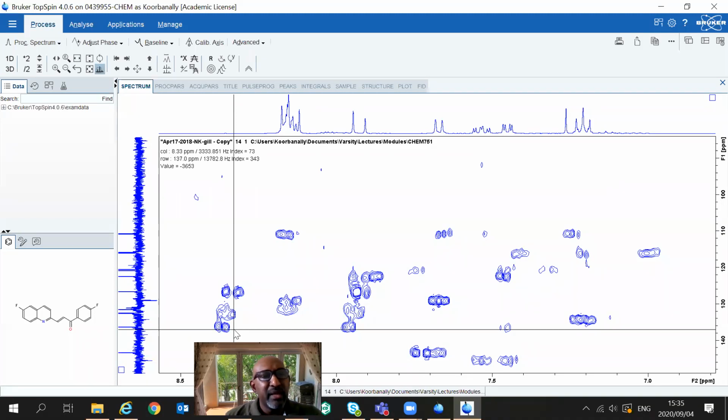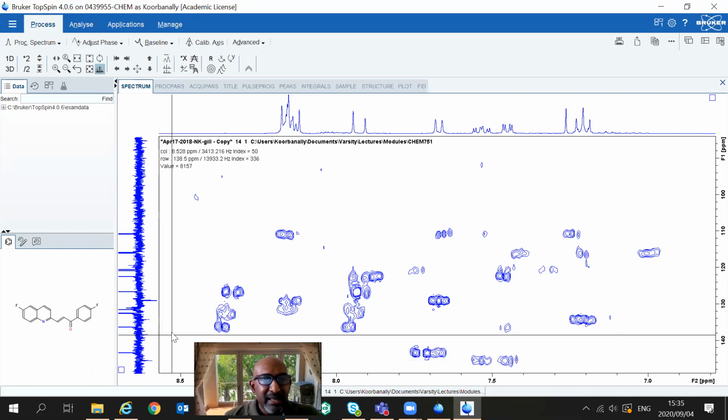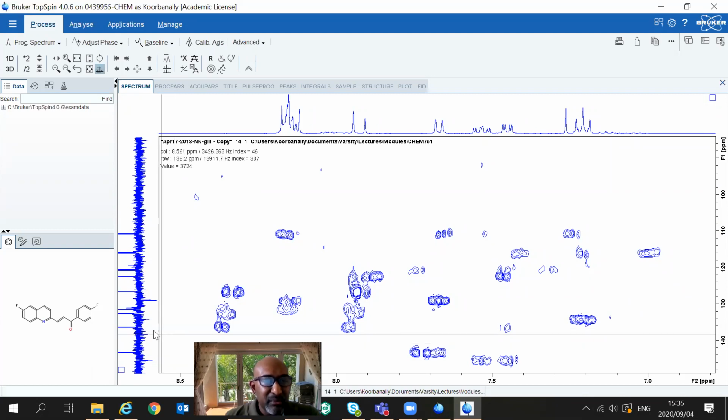Now, if you think further on, we had another carbon peak that was a little bit away, right? And I had two there, which means by default now, the other carbon atom must be that one. We'll go back just now and look at the carbon spectrum. But before we do that, I want to take your attention to something else. If I'm looking at this peak here, remember before when I went through the carbon, I said I didn't know whether this was the peak or that was the peak or whether it was noise. And remember, we couldn't pick this peak up in the carbon spectrum. It was too fine, the noise, to actually pick up. It wasn't even picking up when we were trying to label or identify the peaks, all right?